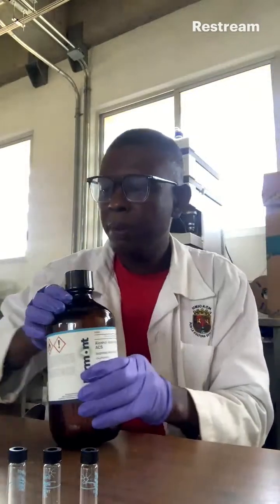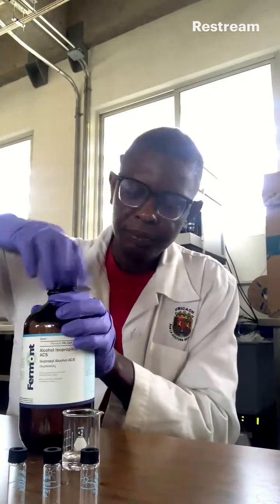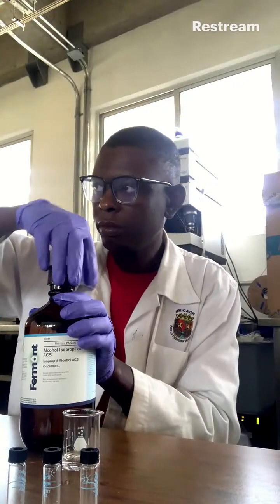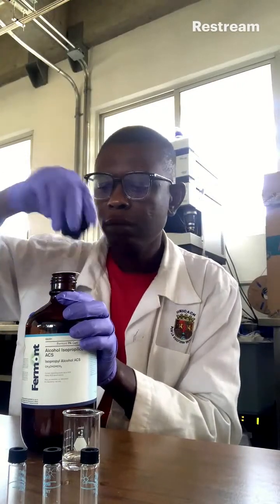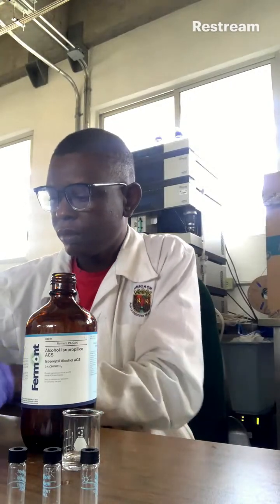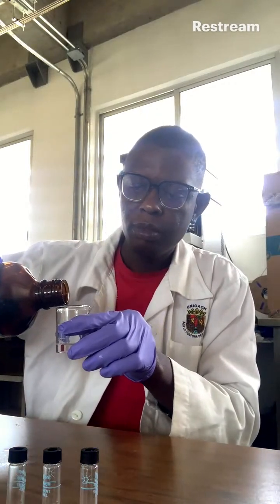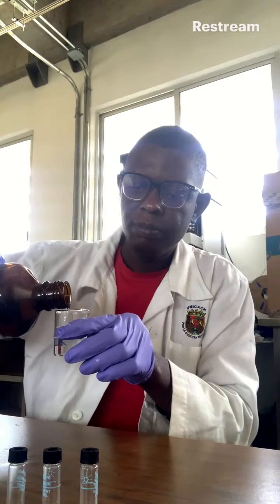This is my isopropanol. So I'll pour in some here, which I will use in doing the washing.